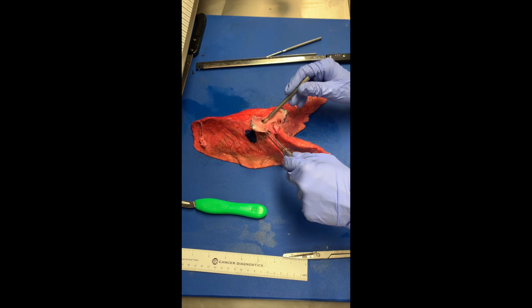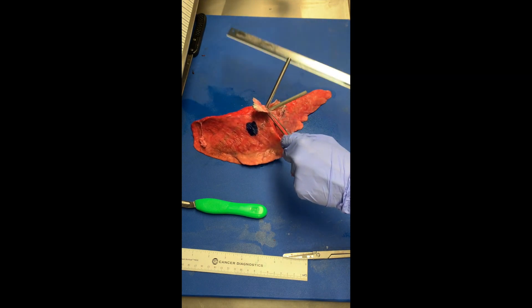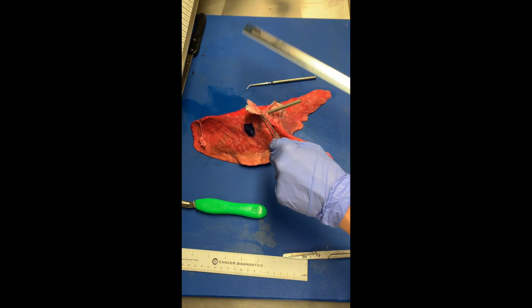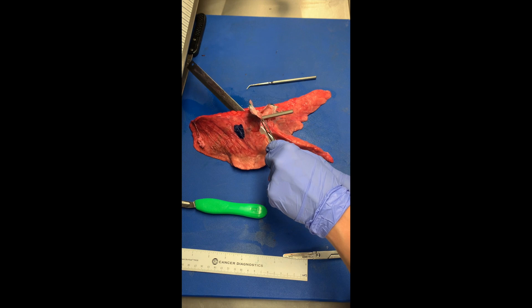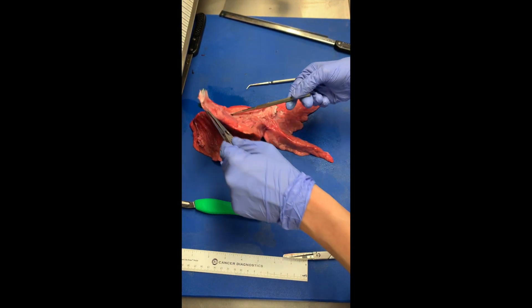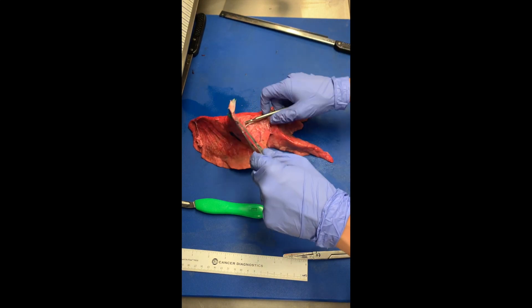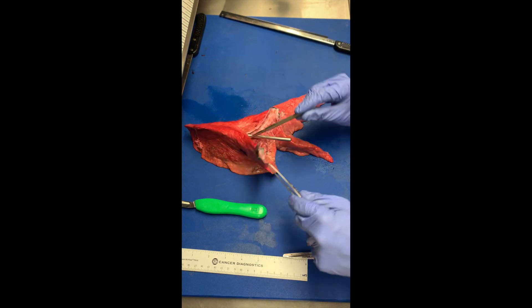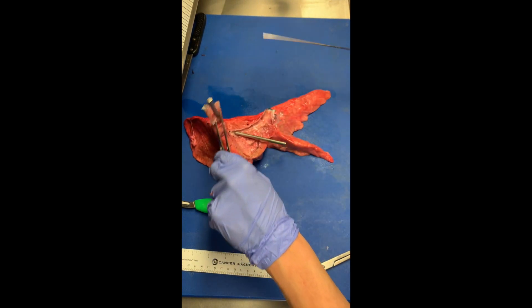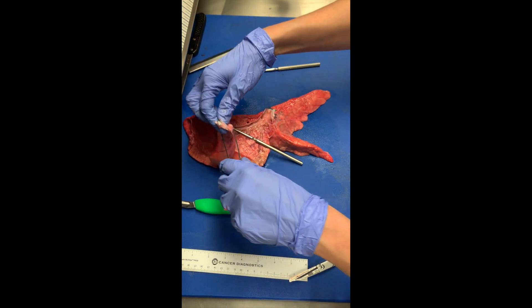You can either readjust your probes at this point or just continue to visualize using your forceps and aiming between the two probes. Eventually you're going to get to a point where you can't continue your cut along the airway because they branch further and further, but we always strive to do the best we can. So we can continue adjusting here.